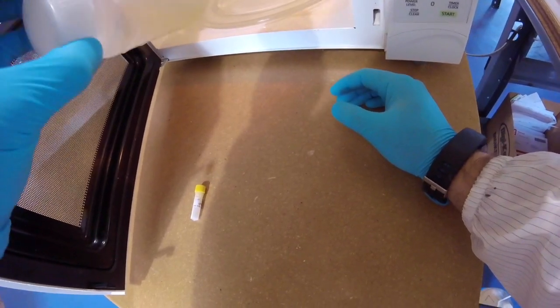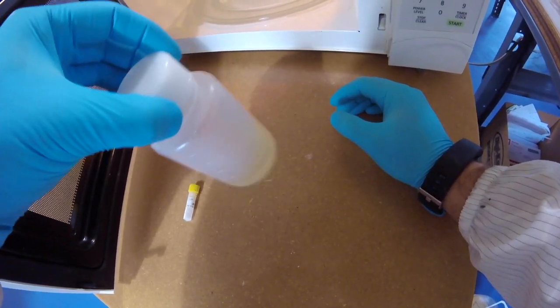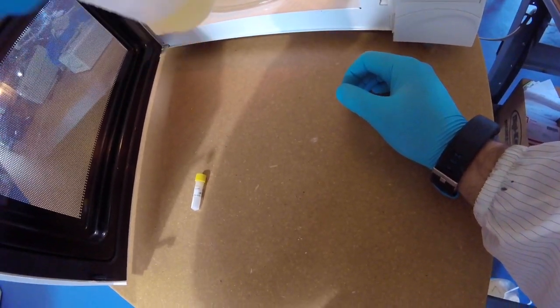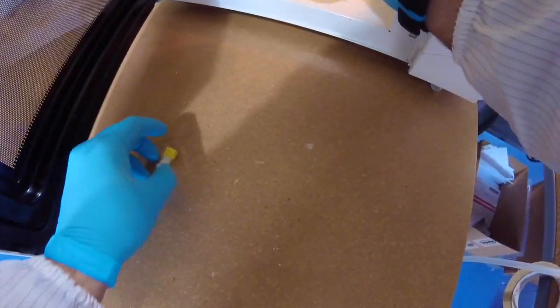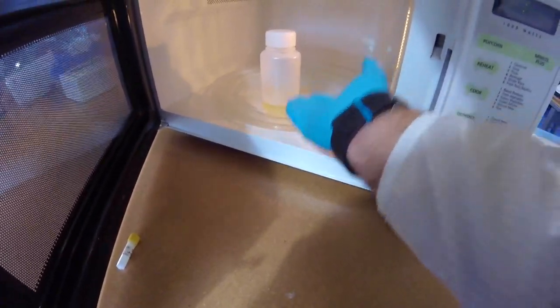You can see there's a little powder on the side there. You don't want to be too vigorous because then you introduce bubbles, and that can disrupt your plates a little bit if you've got a lot of bubbles in there. So this one actually looks pretty dissolved. It's pretty see-through already, but it's recommended that you put it back in for another 5 seconds. And when it boils this time, it's not going to have a rolling boil from the bottom. It's actually going to foam up a little bit.